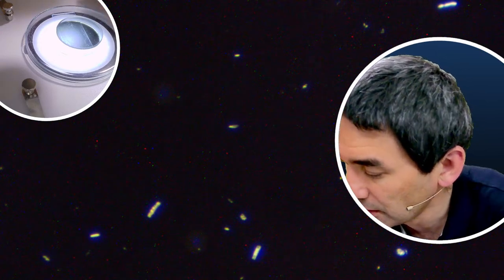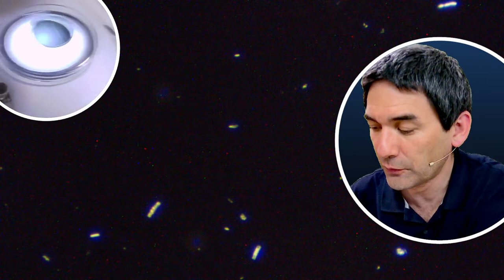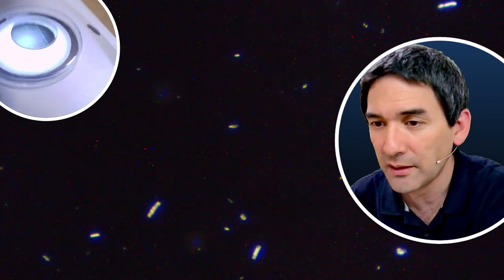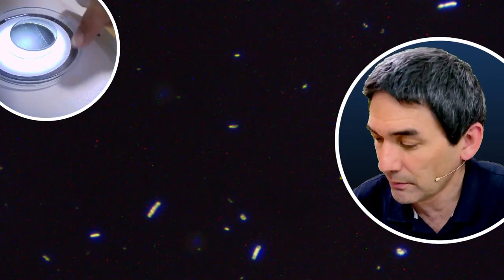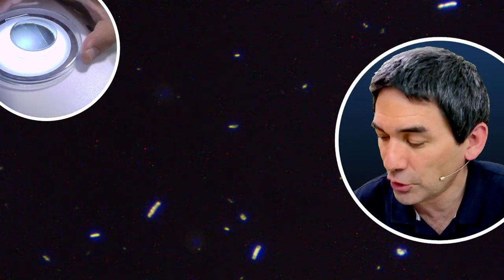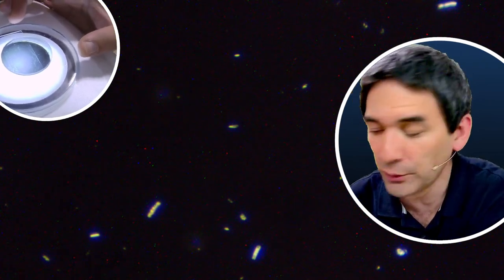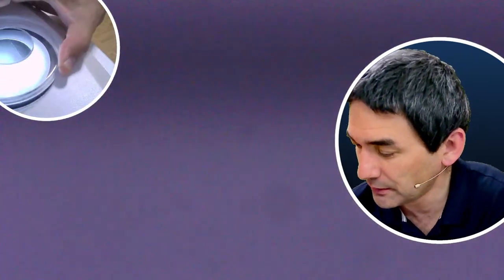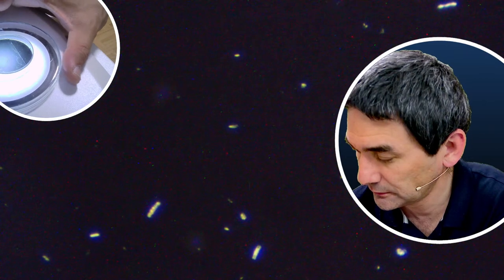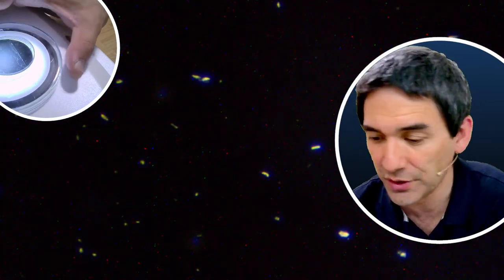I already see that a little bit is starting to happen on the side. But something that you might not want to forget about is that I put a petri dish on top, so it might not evaporate quite as quickly as without the petri dish. If there's a little bit of wind, for example.